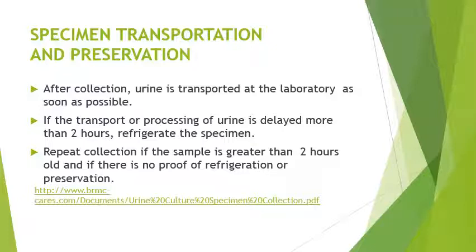If the transport or processing of the urine is delayed more than 2 hours, refrigerate the specimen. Repeat the collection if the sample is greater than 2 hours old, and if there's no proof of refrigeration or preservation. Note kung kunwari also there is a leak, pwedeng i-reject yung sample.